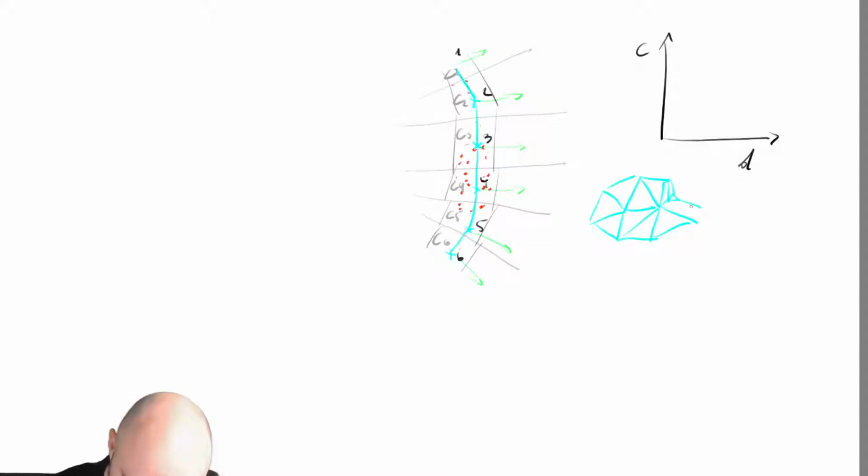You might have some very small triangles, and then some of those subvolumes will just be extremely small. So you're not going to have very good statistics there. So it's going to look very noisy.